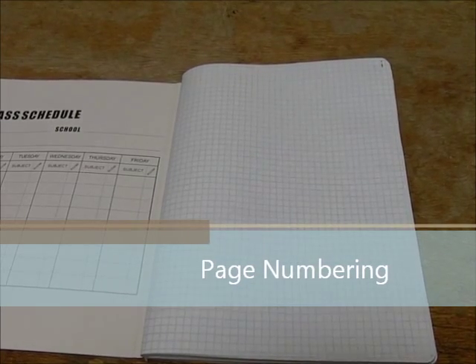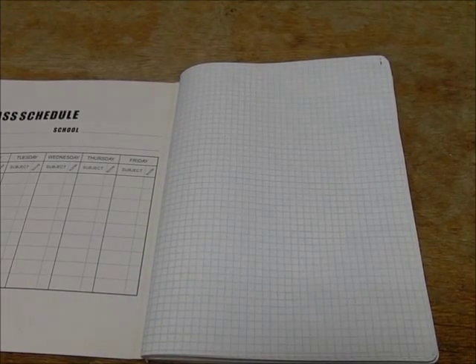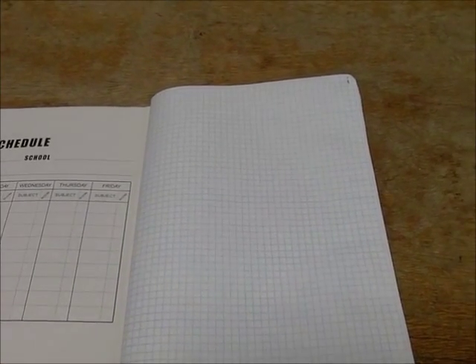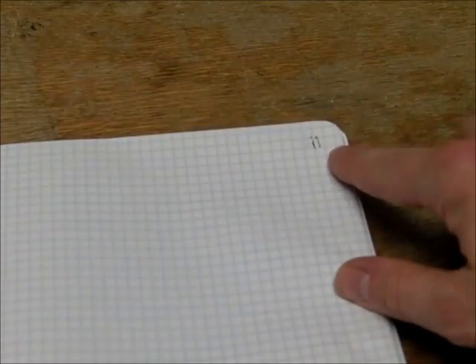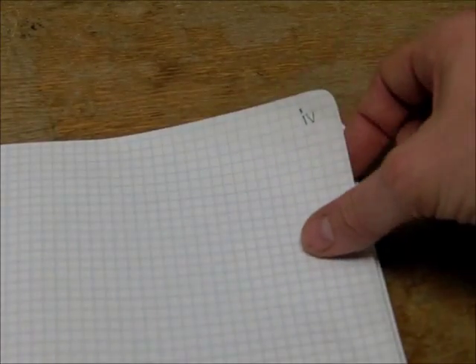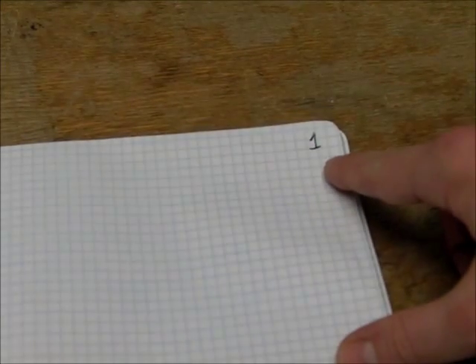I've already started to page number this book. Let's take a look at how I've page numbered it. Since I'm right-handed, I use the upper right-hand corner. If you're left-handed, you'd be using the other side of the paper. In the upper right corner, I wrote down I. For the second page, I did II. Third page, III. Fourth page, IV. Fifth page, V. Sixth page, VI. Seventh page is the number 1.